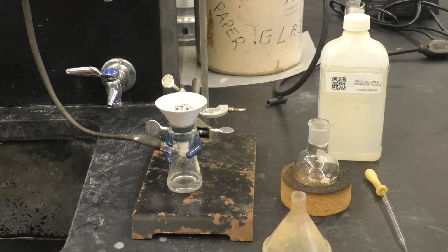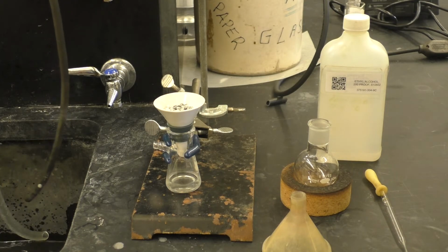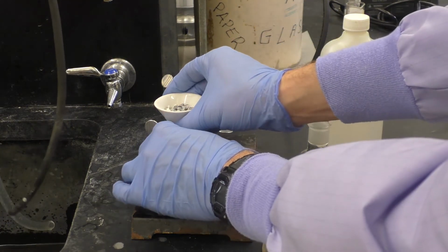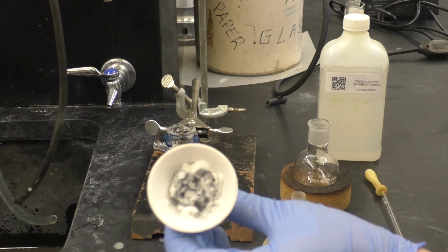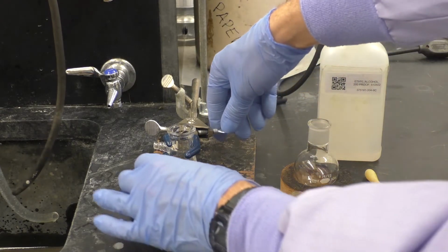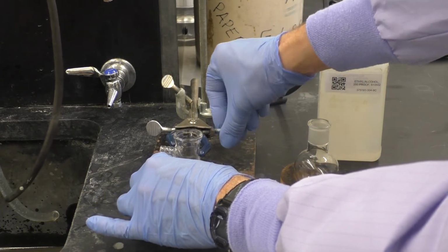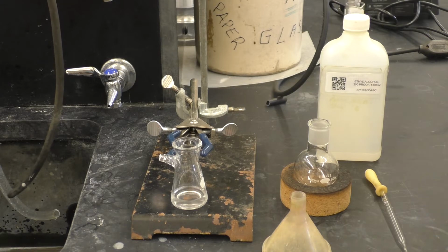Now that my solution is done filtering, I will disconnect the water aspirator and turn it off. I can remove the Hirsch funnel and set this aside. It contains now that pad with the palladium and carbon. And then I've got my solution here, which I want to remove the solvent from to leave me with my product. Now, removing the solvent from this could be achieved by simply heating this on a hot plate, but a more effective manner is to use what's known as a rotary evaporator, also known colloquially as a Rotovap.